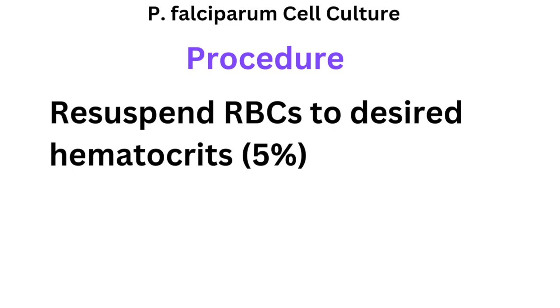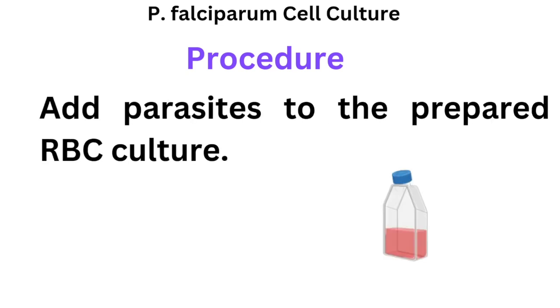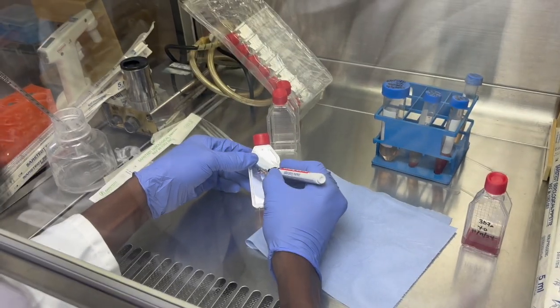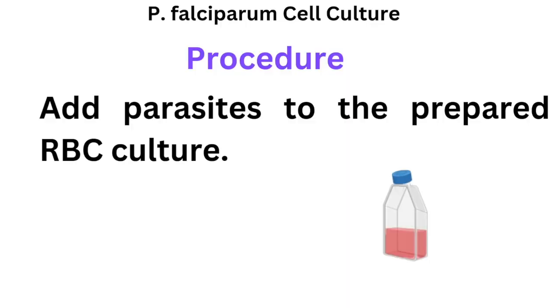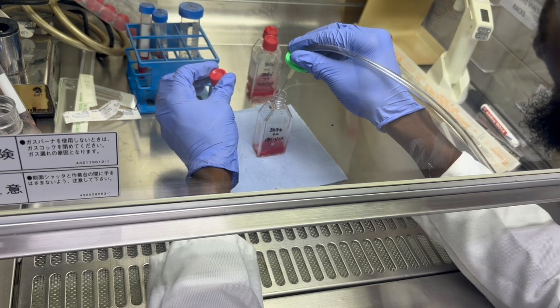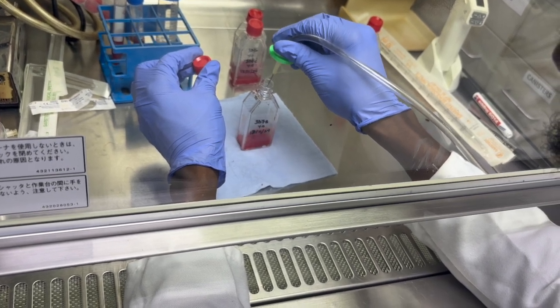Hematocrit is the proportion of blood occupied by red blood cells. Depending on your culture vessel — we're using a 5 milliliter capacity cell culture flask — add the required volume of blood, then add your parasites to the red blood cells. Before sealing, gas the system with the mixed gas for 20 seconds, then tightly close the flask and place it into a 37-degree incubator.